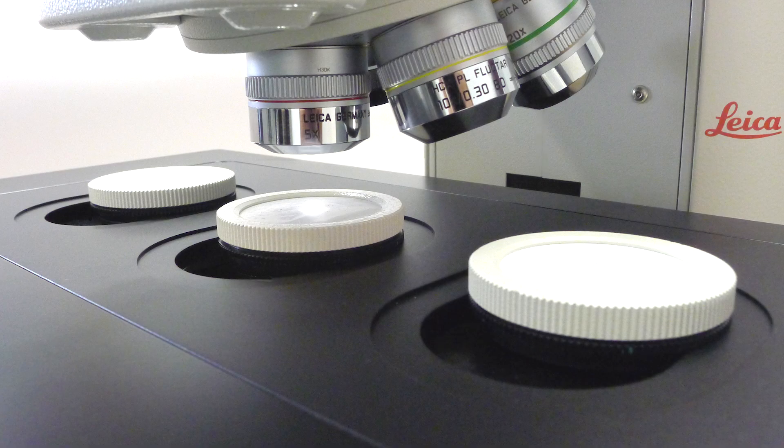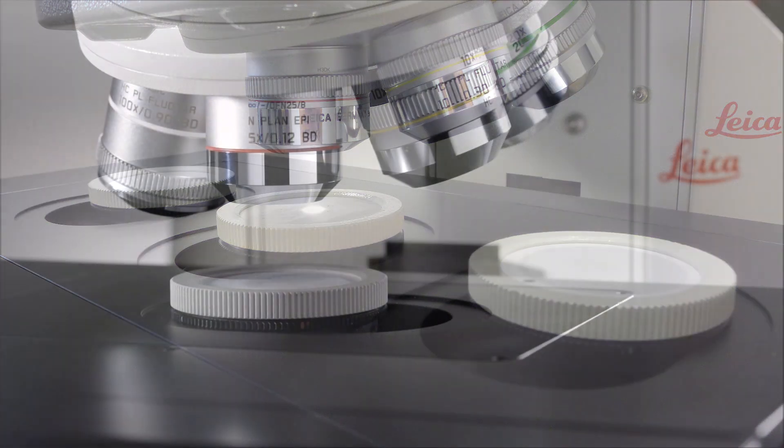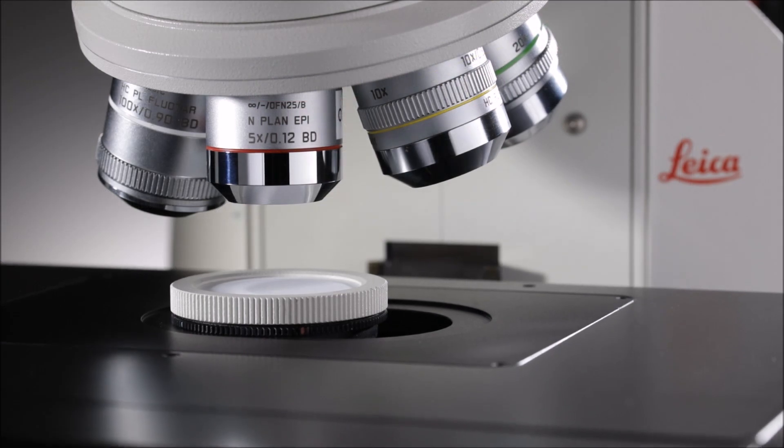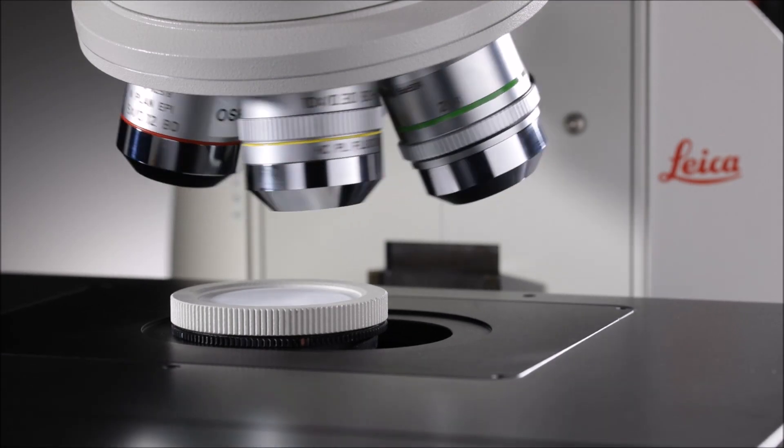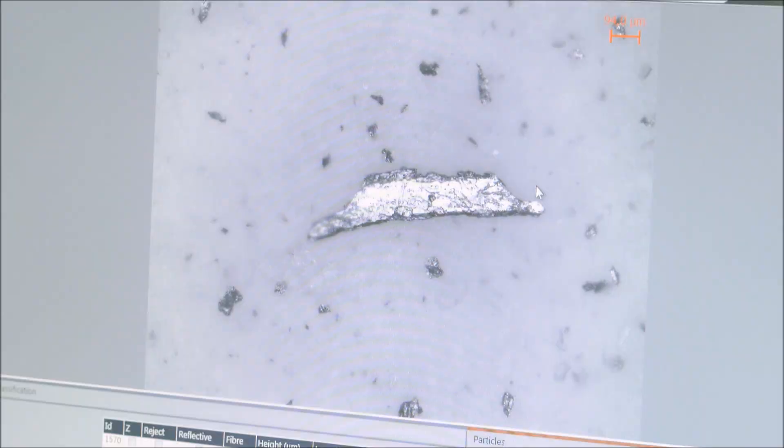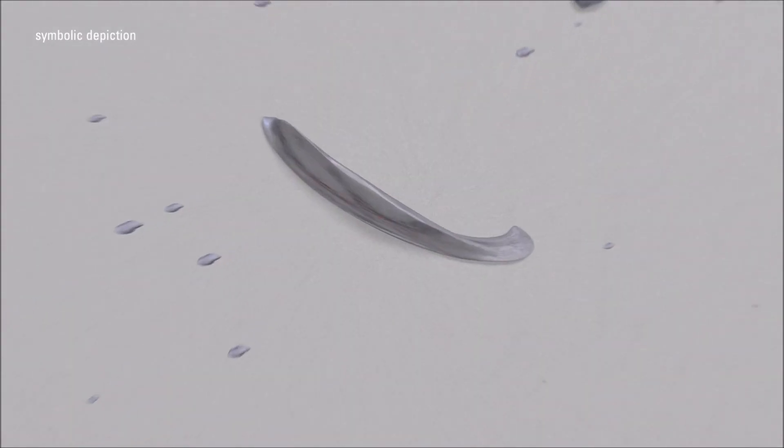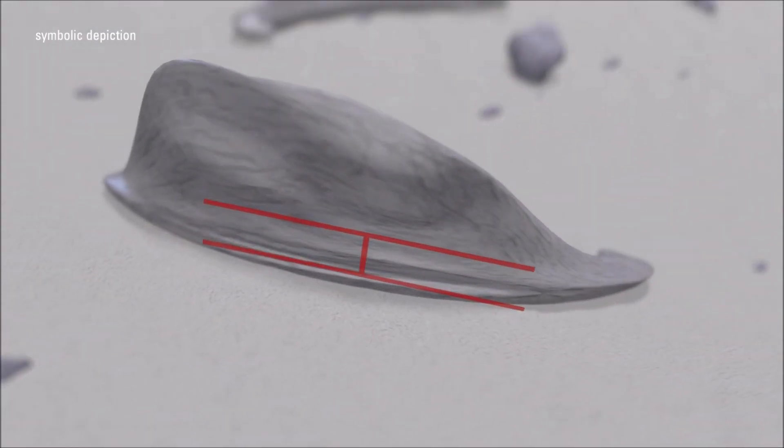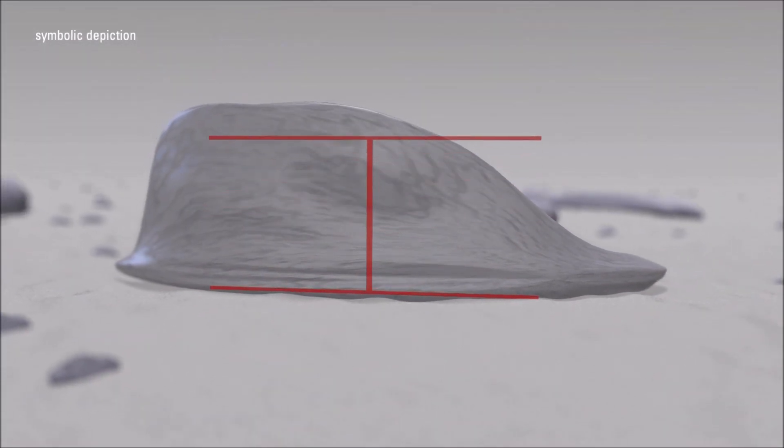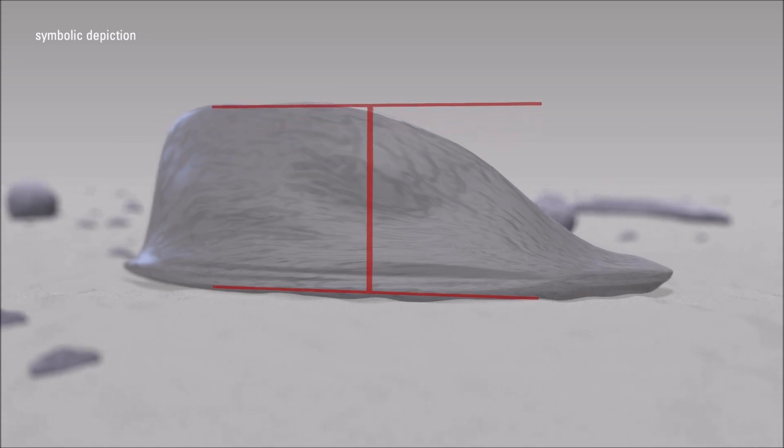Go from multiple filter imaging to analysis and then reporting of results in minutes. Here's how you can do it in the LASX Cleanliness Expert solution.